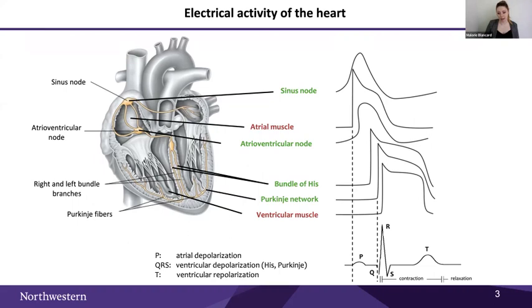The sum of all these action potentials you can see on the electrocardiogram. I want to make sure everyone understands that part, because I'm going to use it later to talk about the system that is available on the core.